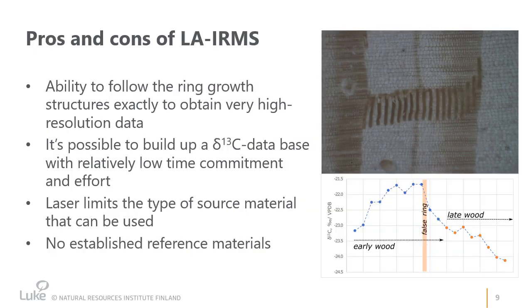There are a couple of things that one should keep in mind concerning the laser ablation IRMS method. Well, the first thing would probably be that with this method, it's quite easy to obtain very high resolution data from tree rings, because you have the ability to have multiple analyses per ring, and also you can select your analysis points according to the ring structures you see in your sample.